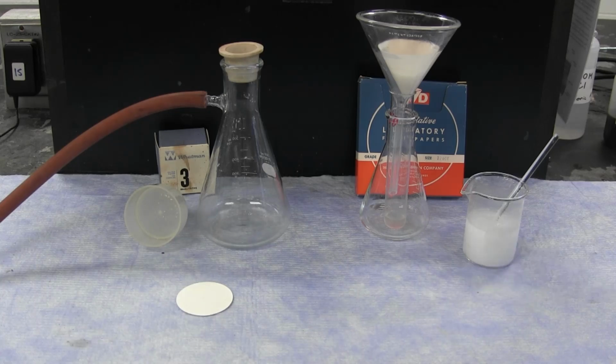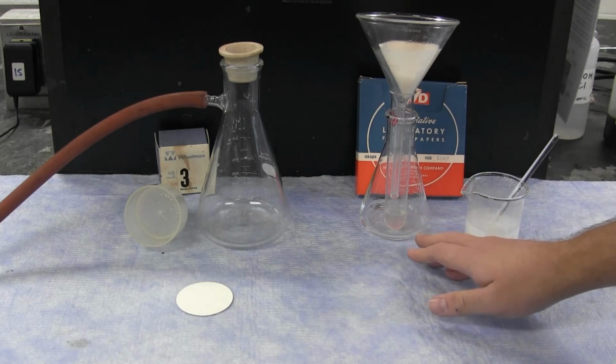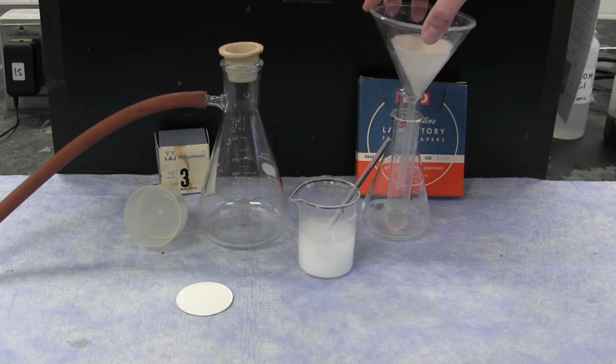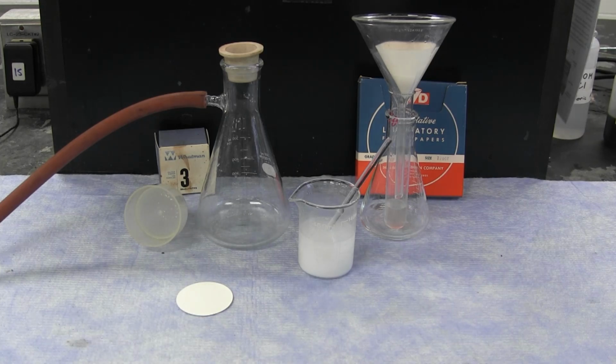There are different grades of filter paper, as I mentioned, and sometimes it is necessary for analytical and very accurate filtration to pass the filtrate through a number of different steps of filter paper. Typically, this is good for most types of preparatory techniques where you need to filter out large pieces or larger precipitates, and the filtrate below can then be analyzed.